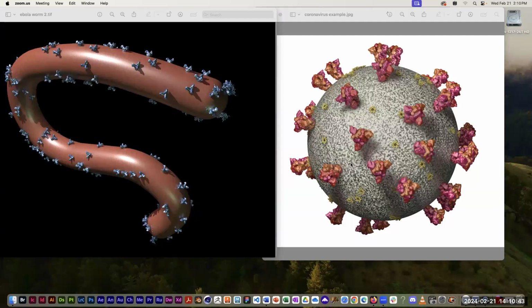So light microscopy, you have the images themselves, you have the light micrographs, they're called. With electron microscopy, you have the electron micrographs, the images themselves from these different kinds of microscopy. But you don't have any kind of 3D data that you could convert into some other format and maybe bring into Cinema 4D or Maya or something like that.